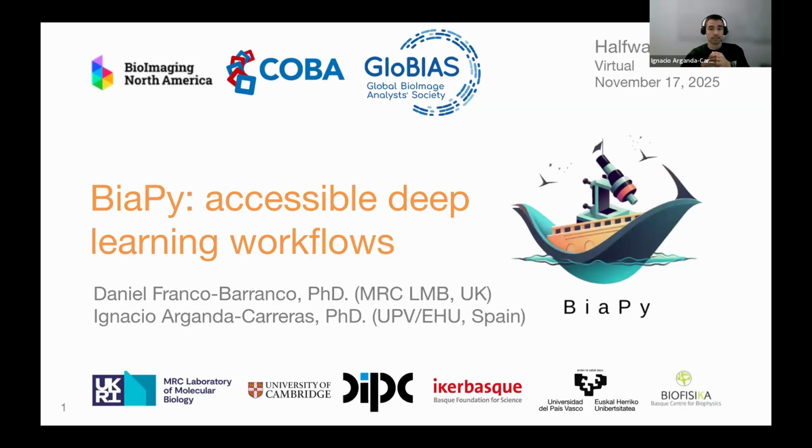Today, the presenters will be Daniel Franco-Barranco and I, who are the main people responsible for BiaPy, which is this software that I will introduce to you in the next half an hour or so. That is our tool to create what we call accessible deep learning-based workflows.